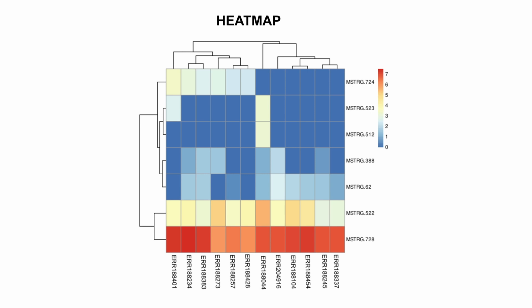In addition to these plots that I have just displayed and explained, there are other visualizations that you can do to understand and interpret your gene expression data, but these are things that we will cover in later tutorials.